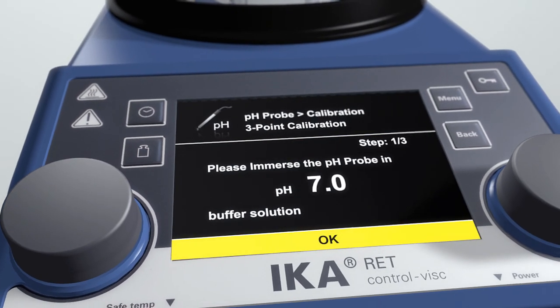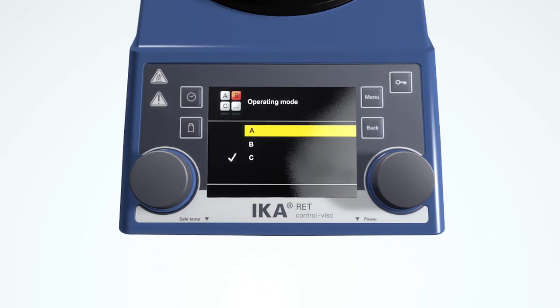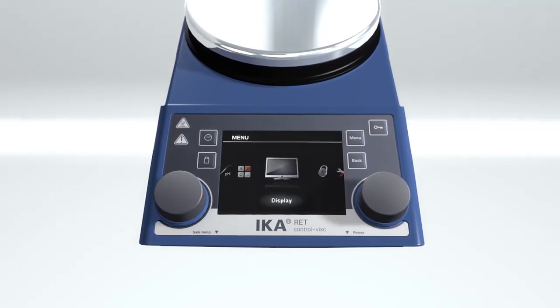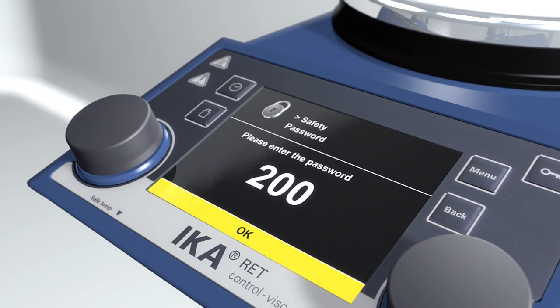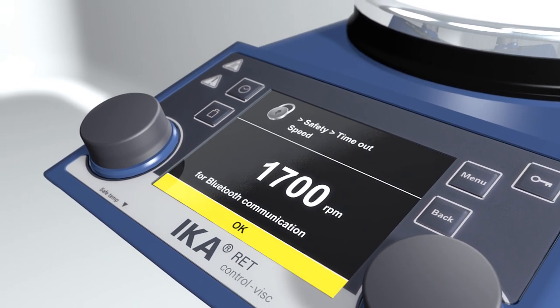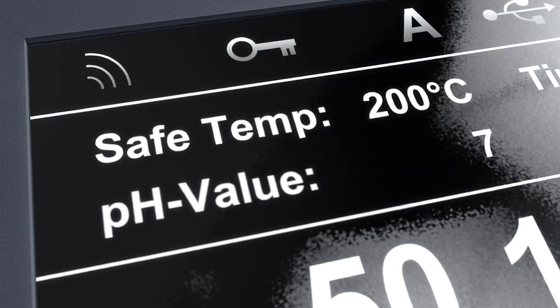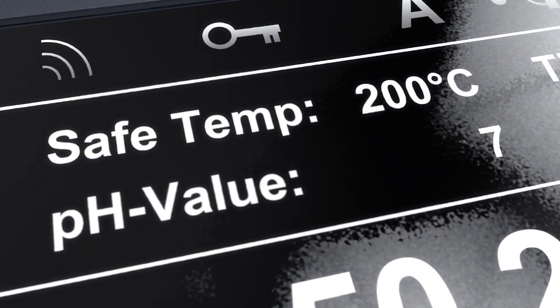Adjust pH probe settings and change operating modes A, B, or C, as well as display settings. Safety settings such as password protection or parameter limits can also be configured. The display will show safety temperature, pH value, and timer.